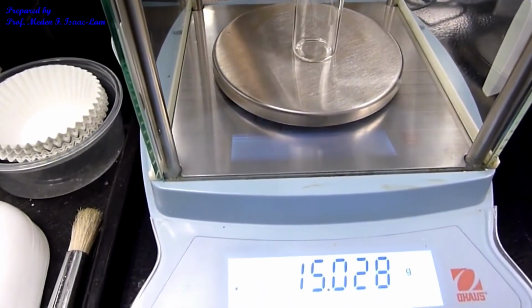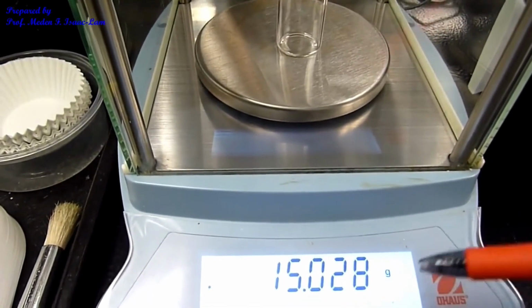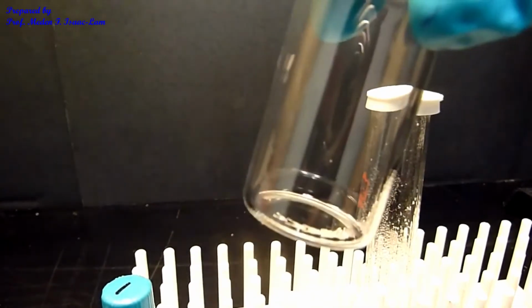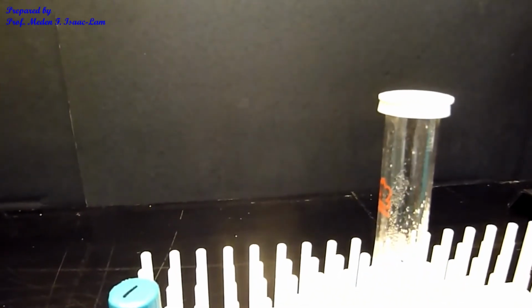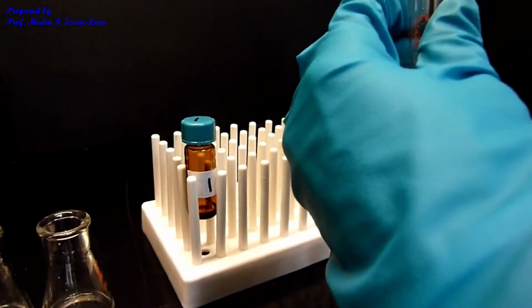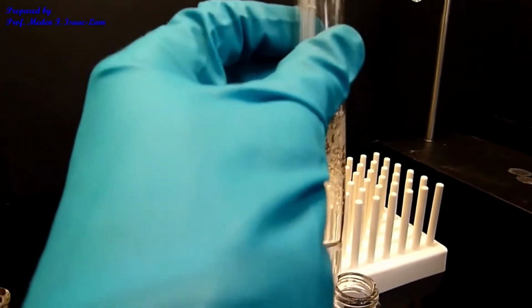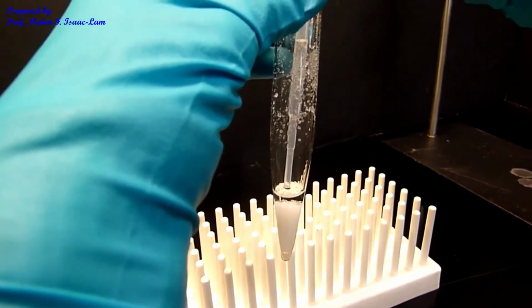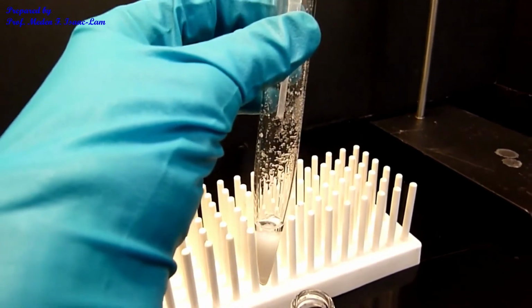This is the tare weight of the vial with the cap, and right now the weight empty is 15.028 grams. So I let the sodium sulfate absorb the water in the conical tube. I have the conical tube in here, and I'm now going to pipette the liquid, the ester, into the tared, pre-weighed vial with a cap. So I will take out the liquid. Now taking out the liquid slowly, so that I don't disturb the sodium sulfate.